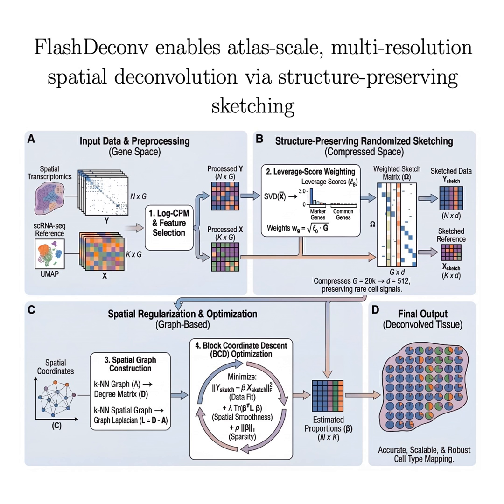We are seeing a shift in biology right now that is genuinely just breathtaking. Oh, absolutely. You have these technologies like StereoSeq, Xenium, and now this new high-resolution Visium HD. They're just pushing the frontier of what we call spatial transcriptomics. Right. We're not just looking at snapshots anymore. We're building entire atlases, blueprints of tissue with millions of spots, millions of cells all mapped out. It's the next revolution, for sure.